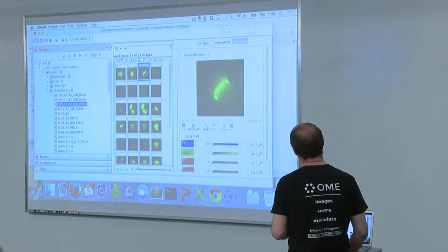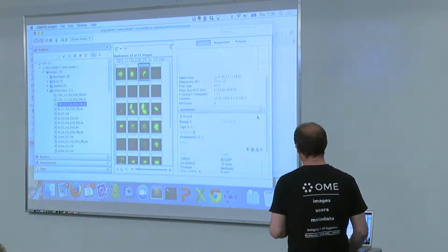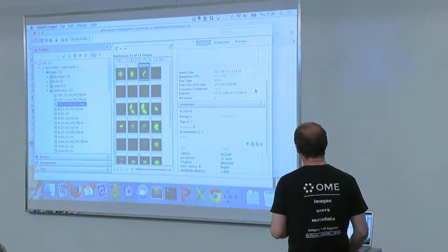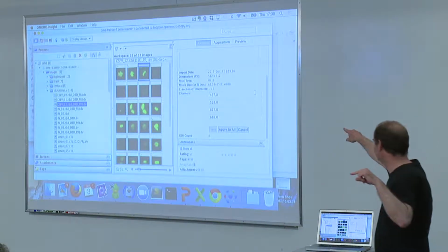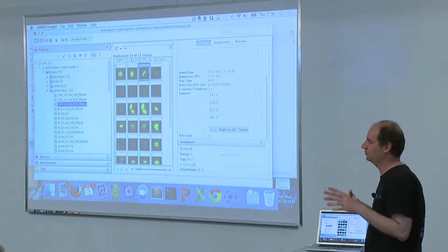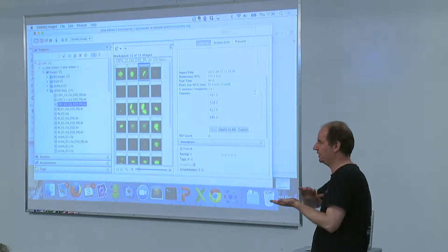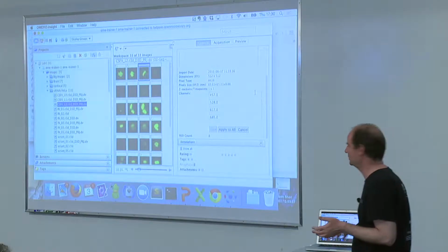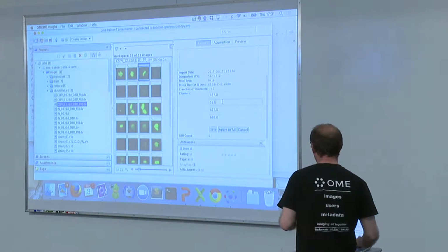The other type of batch actions would be a naming of channels. So for example, I can rename the channels which are coming from here. Now, I would like to draw your attention once more to the fact that I'm not changing the original data, which are stored for you as they are. What I'm doing is to put on it another layer, which is helping you in OMERO to organize your images. So, for example, you would like to call this FITC channel.